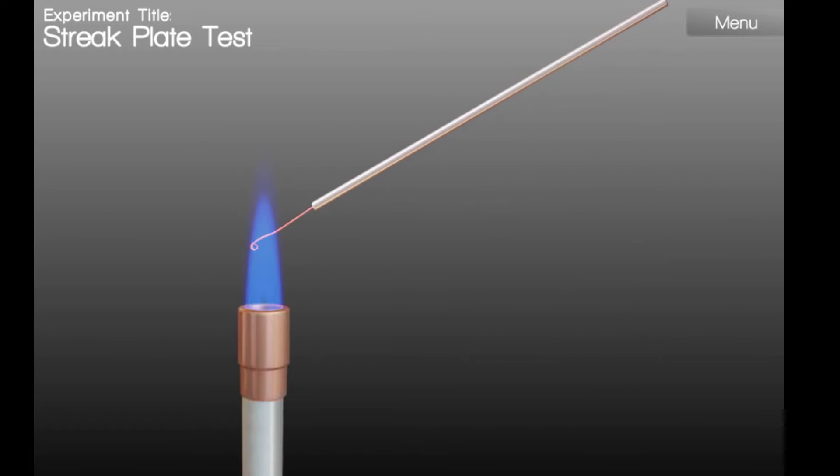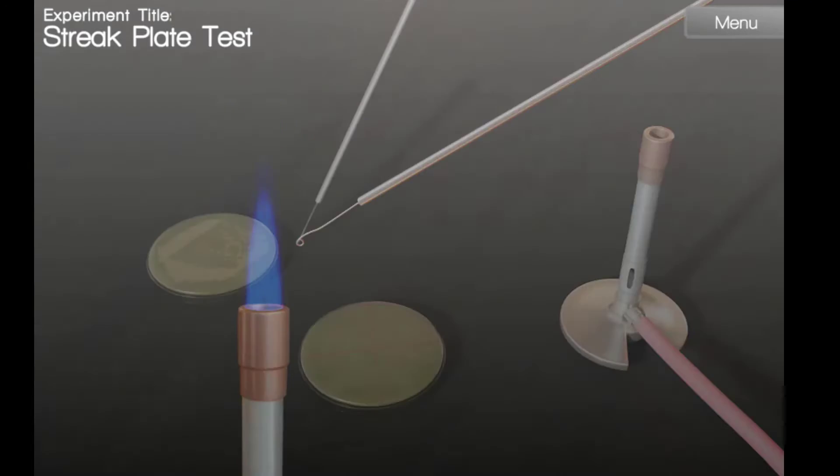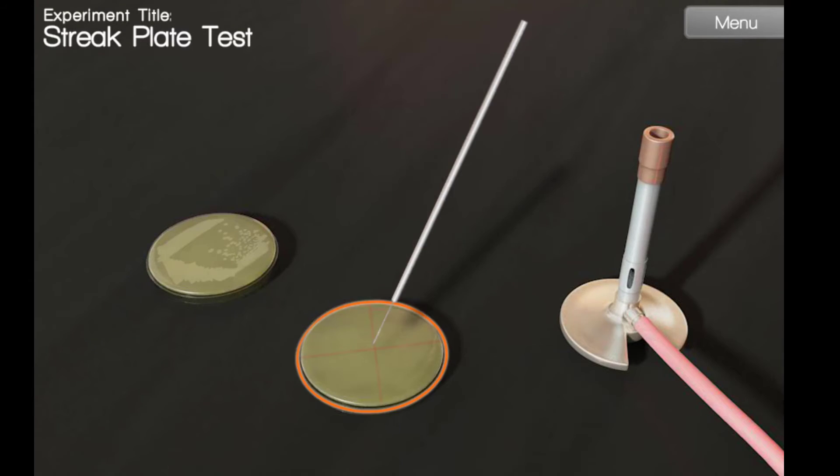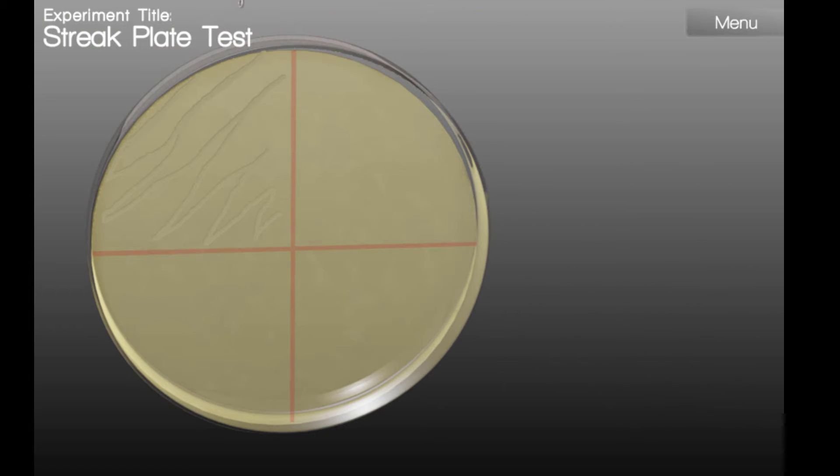Now we're going to flame the loop once again. This gets rid of any residual bacteria on the loop. Now we're ready to streak our second quadrant. When streaking the second quadrant, we're going to want to drag a small amount of the inoculum into the new quadrant.